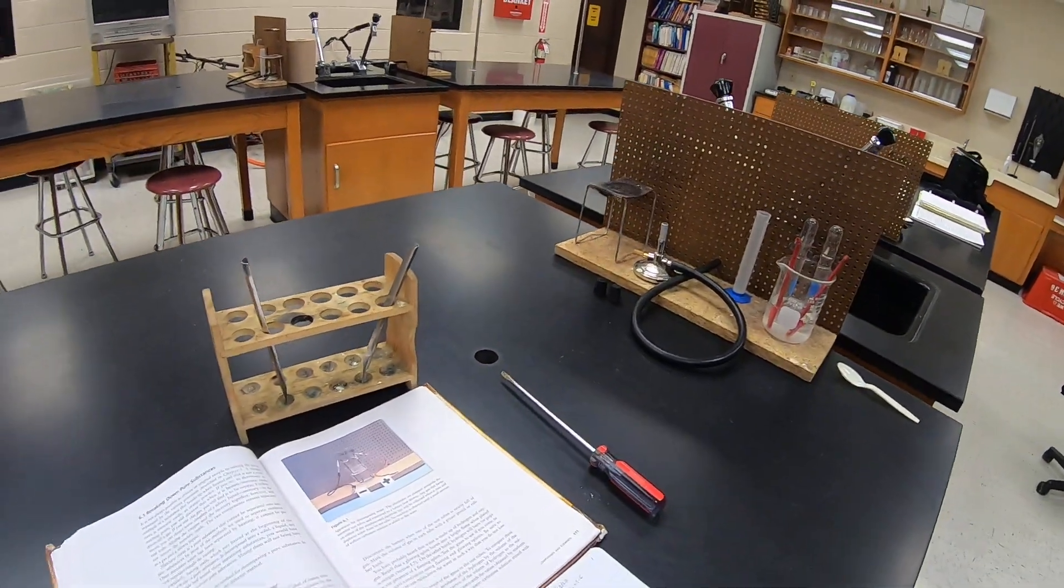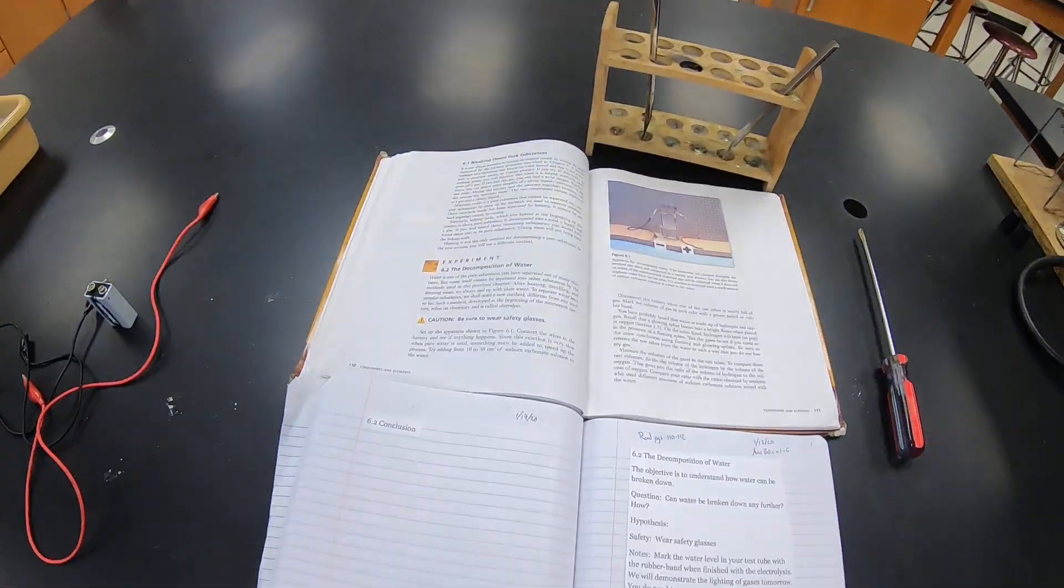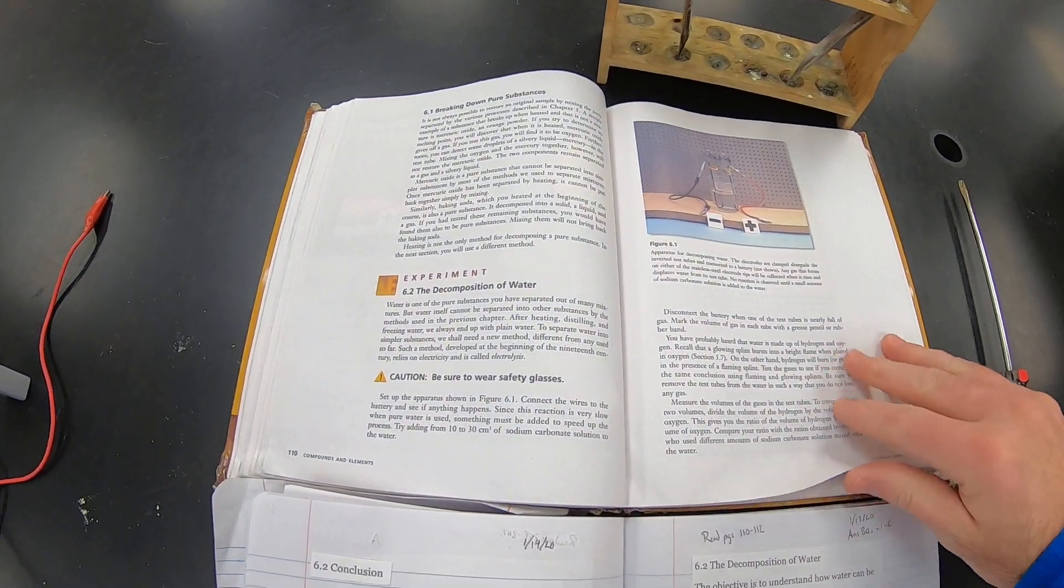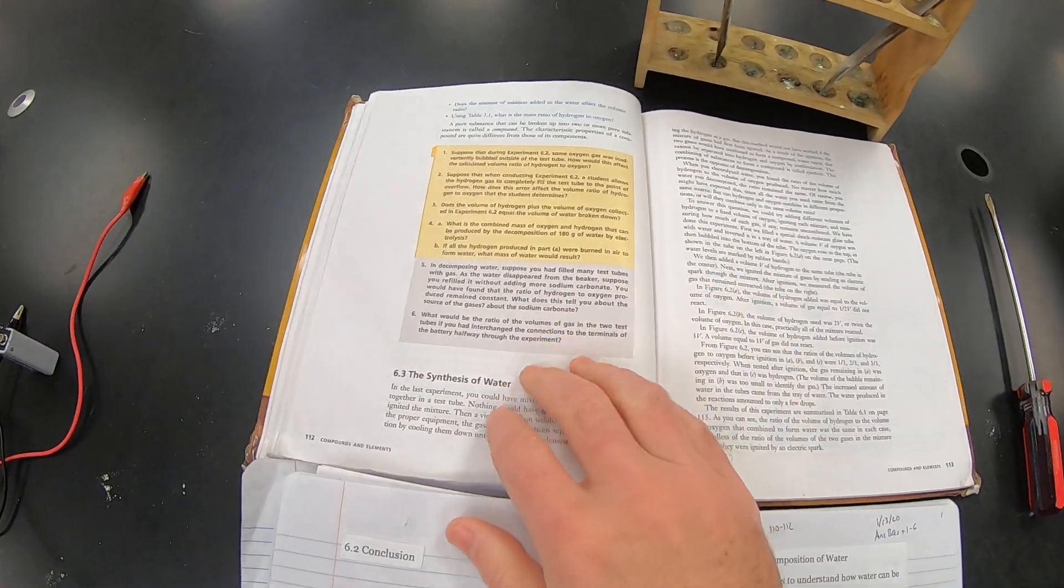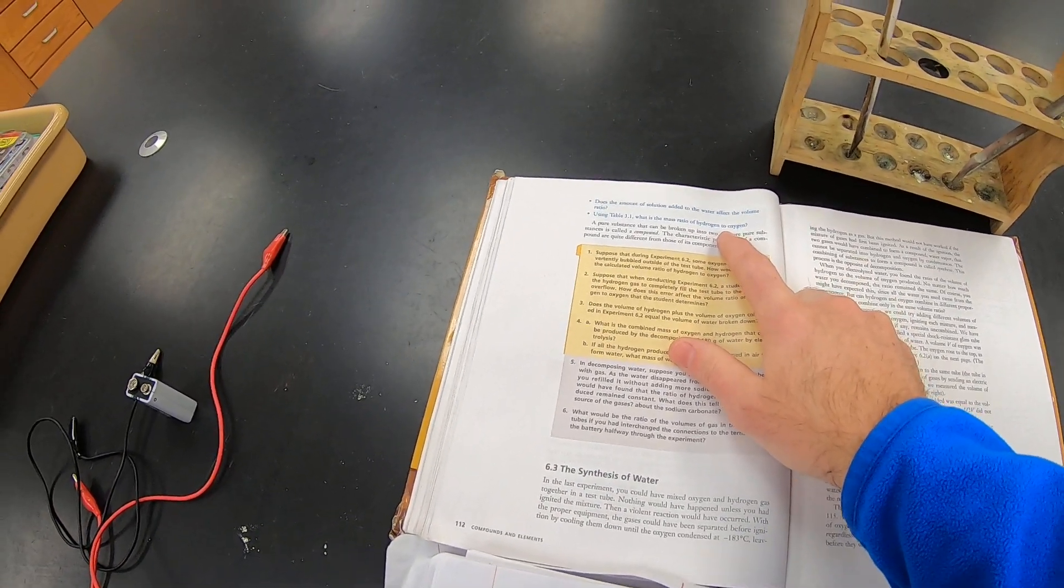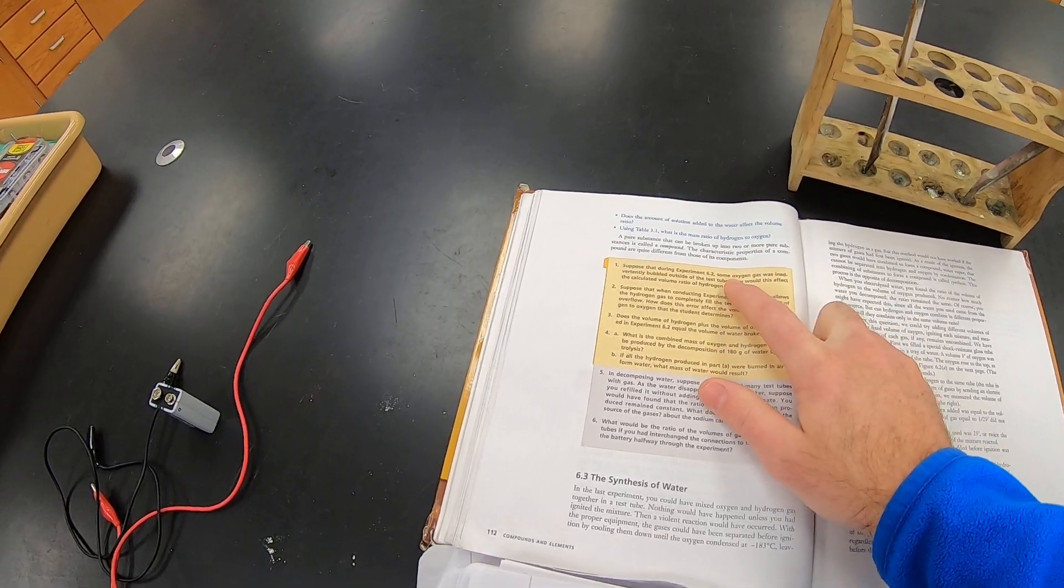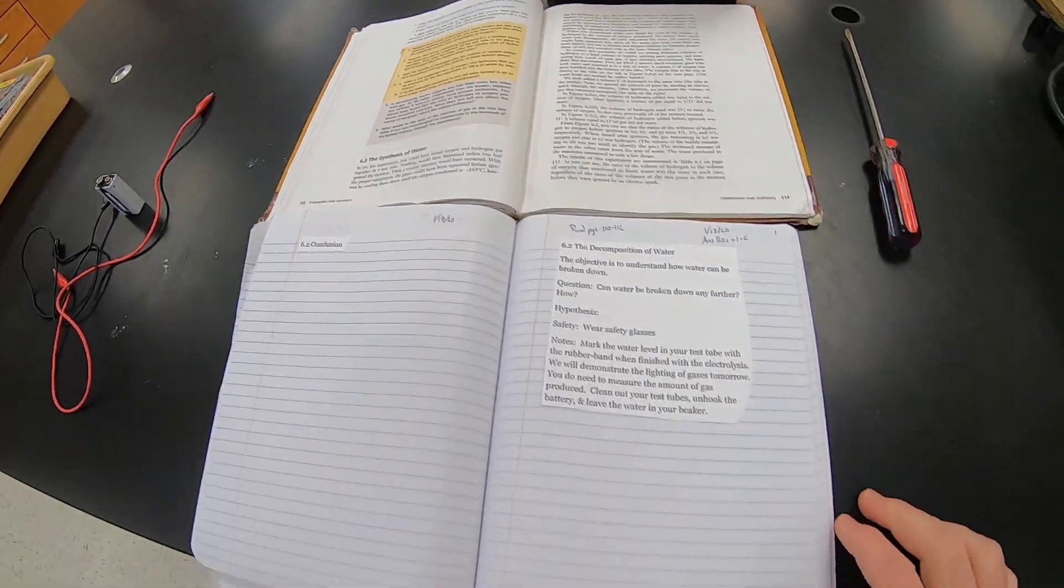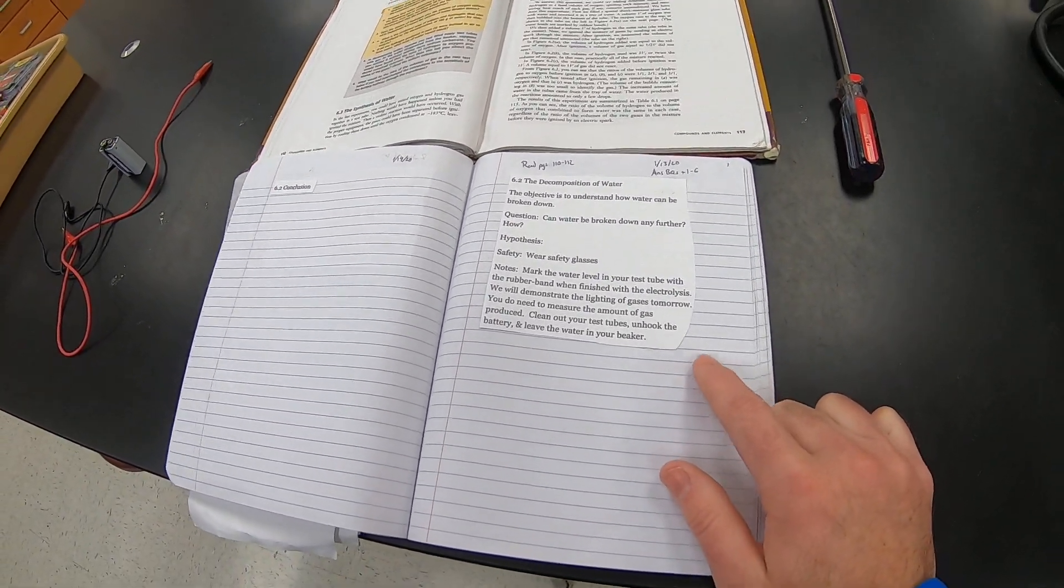All right, we're going to do the first part of the decomposition of water lab. This is stuff from the book, page 110, 111, and 112. There's two blue questions to answer and six numbered questions that you'll need to answer. And here's the notes that you'll need in your book.